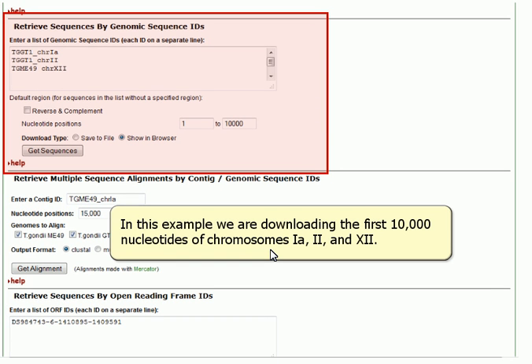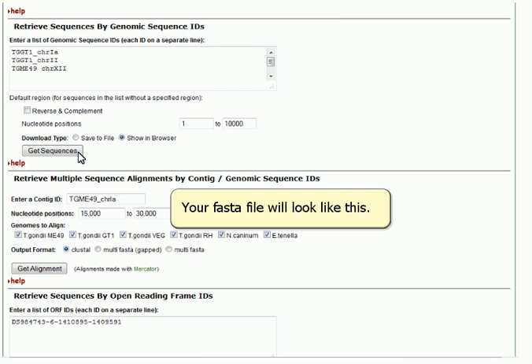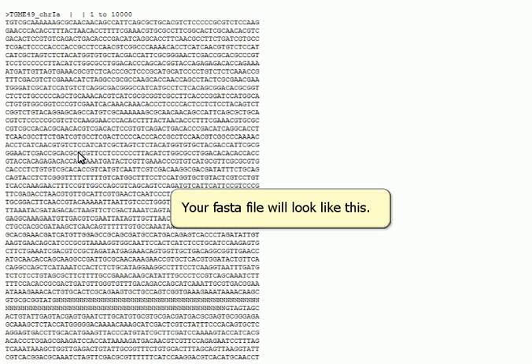In this example, we are downloading the first 10,000 nucleotides from chromosomes 1a, 2, and 12. Your FASTA file will look like this.